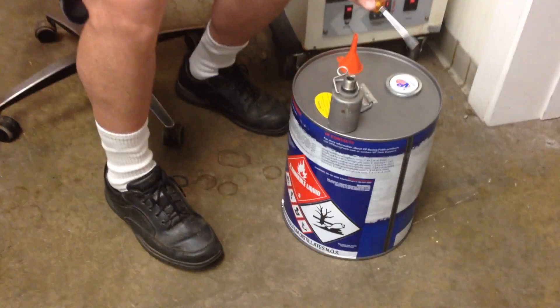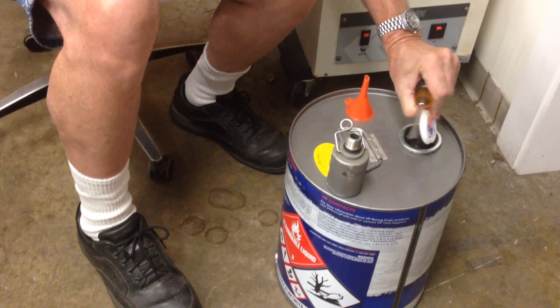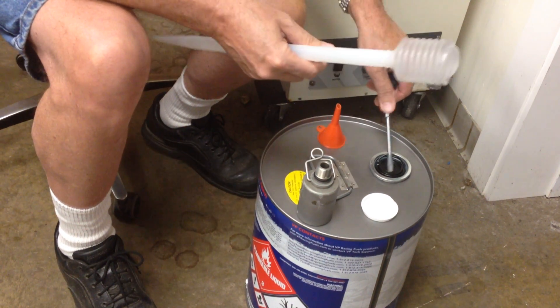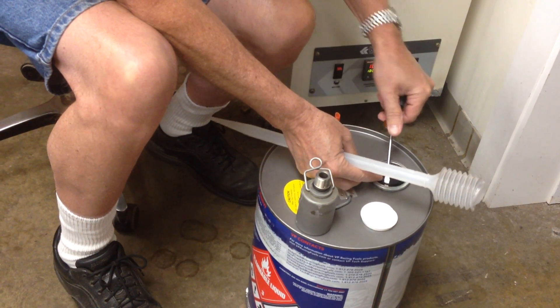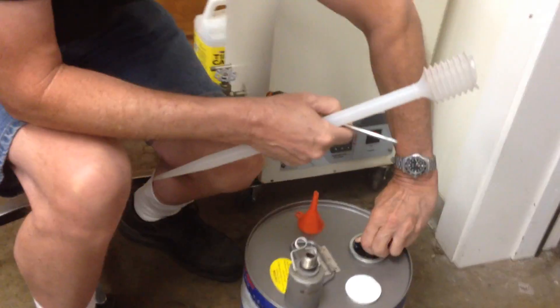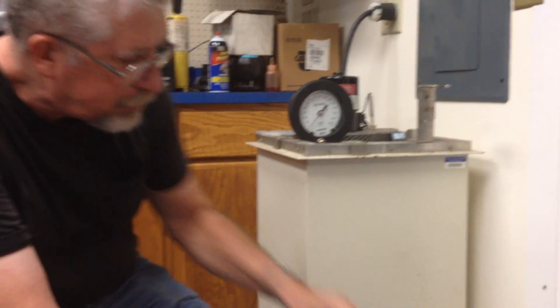This is a sealed pail of C14 Plus. We're going to test the Reid vapor pressure. This has a RVP rating of 5.5 PSI. This is a Kohler RVP test machine. It's up to 100 degrees Fahrenheit and the test bomb is preheated to 100 degrees.